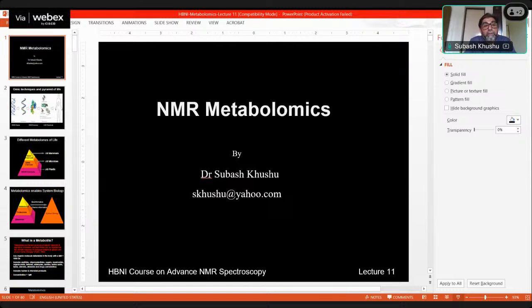The time to collect basic data is 5 minutes for NMR. It is a minimum of 10 minutes for UPLC or MS. The quantitation is 1 to 5%, and robustness of instrumentation is very high in NMR. NMR instruments are very robust, and there are hardly any breakdowns. Whereas robustness of the instrument is low in MS because of the maintenance of the columns and other subparts of the equipment.